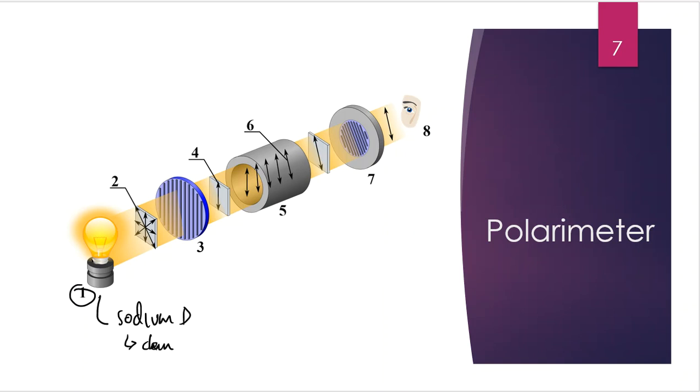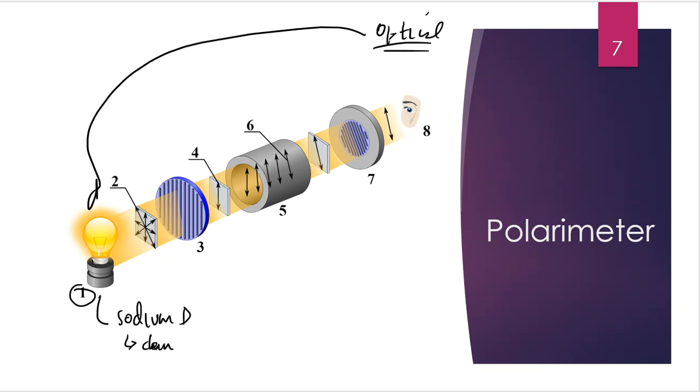In most polarimeters, especially some of the older ones, you find sodium D lamps that get plugged in and turned on, and that's our light source. Think about it: if we're using a polarimeter, we are looking at optical rotation, and in order to get optical rotation, ta-da, we need a light bulb. I think that makes sense, right? So there's our light source, and now we're going to be looking at how our molecule will turn that light, whether it will turn it left or right.